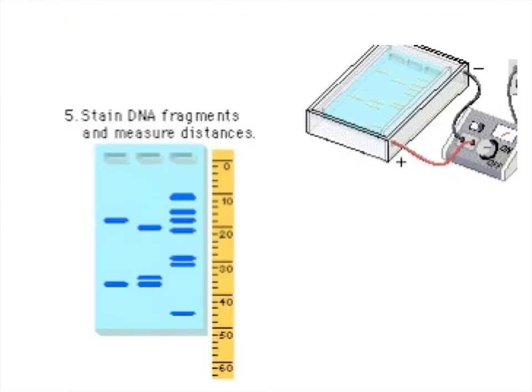By now all of you should have a picture of your gel, and I'm just going to use this hypothetical gel right here as an example. In this gel, the standard was loaded in this lane right here, so this corresponds to the DNA standard lane. If your picture of your gel is very small, it might be easier to print out a picture that's been expanded in size, so you make it a little bit bigger on your piece of paper.